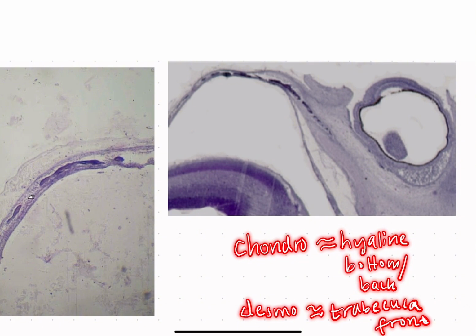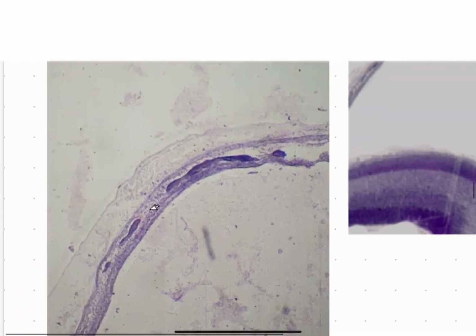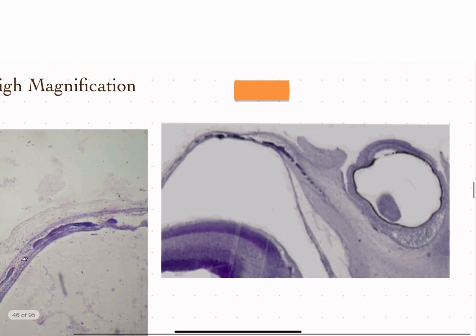In this case, I hope it makes sense to say that this would be more like the desmocranium and not the chondrocranium because of its segmented visual style, and because it's also towards the front area of the skull. We can still see the eye here, for example.